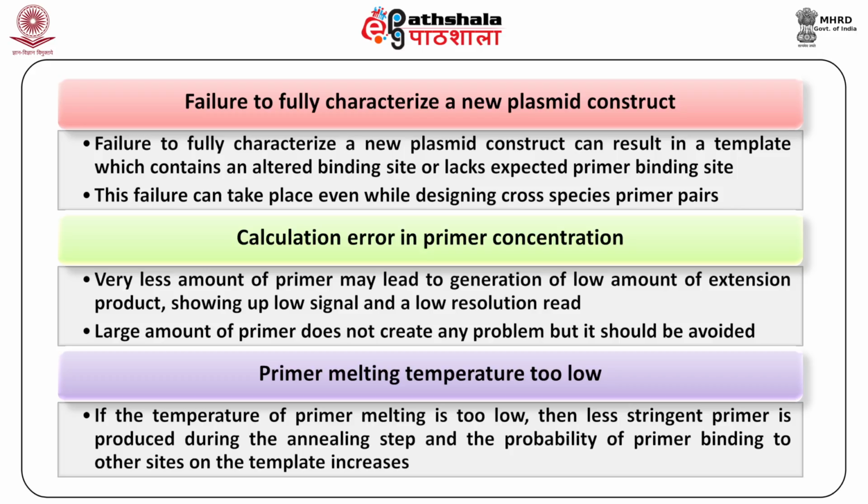This type of failure can occur in the template. Failure to fully characterize a new plasmid construct can result in a template which contains an altered binding site or lacks the expected primer binding site. This failure can take place even while designing cross species primer pairs.